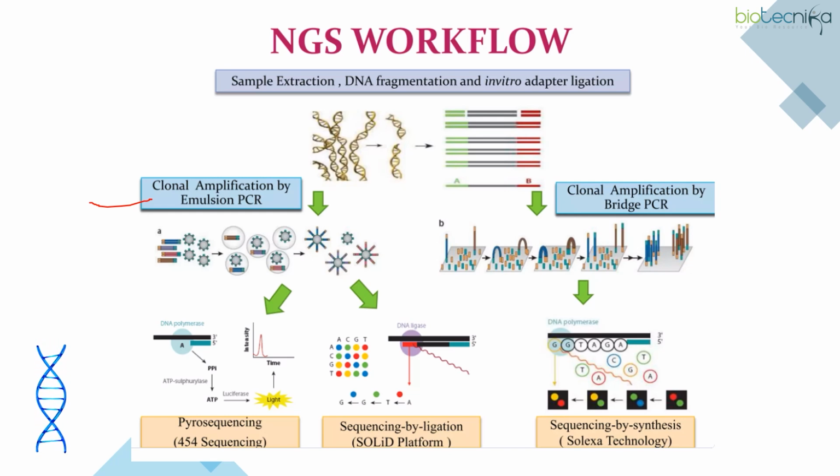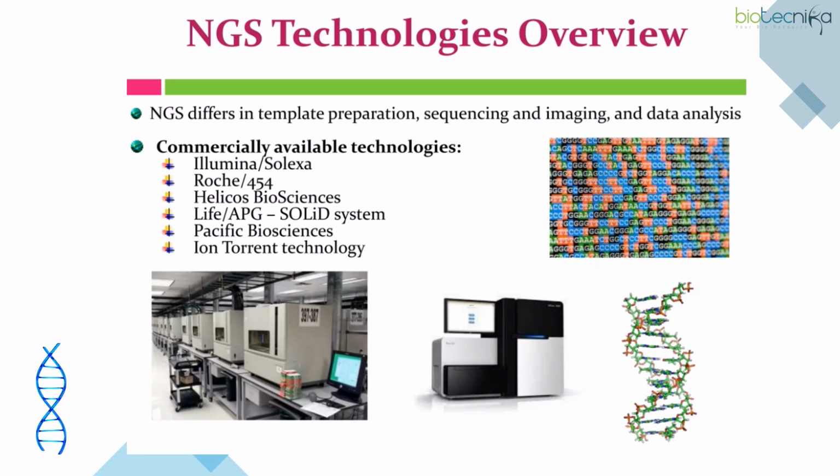Okay, and afterwards you can see here that it basically uses the sequencing method called pyrosequencing, and sequencing by ligation. Okay, that is a platform we have discussed previously. And then it will even use Solexa, that is the Illumina based technique. So these are the best techniques used to sequence by synthesis. And then according to the workflow, it will give you outputs, right?